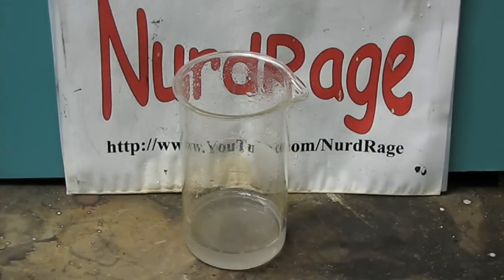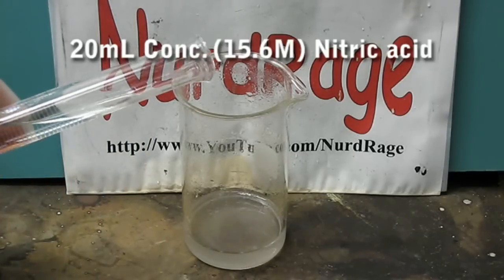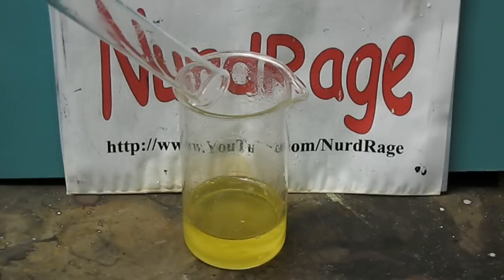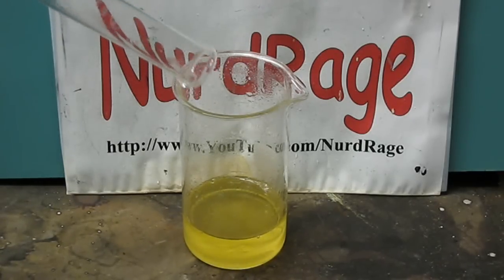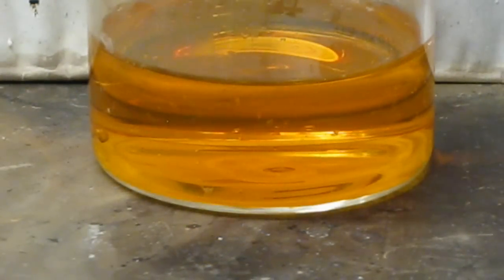Now we want aluminum nitrate, so to convert it we add 20 milliliters of concentrated 15.6 molar nitric acid. The nitric acid reacts with the chloride ions in the aluminum trichloride and oxidizes them to nitrosyl chloride. This bubbles out of solution and leaves behind aluminum nitrate. This gas is rather toxic and the mixture should be left in the fume hood or outside to dry.